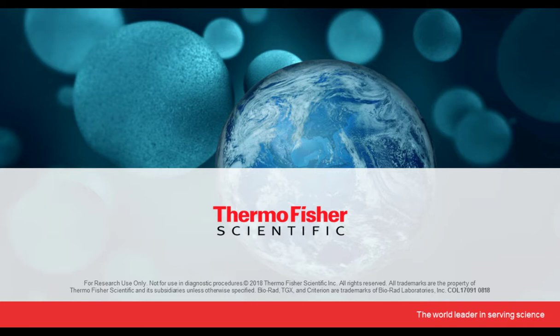If you home brew that buffer, that's absolutely fine. But if it is a Bis-Tris gel, you have to make sure that you are using the Bis-Tris running buffer in that case. So all of our precast gels, we have ready to use running buffers, but at the same time, they are compatible with the home brewed running buffer as well, as long as the right recipe is used.